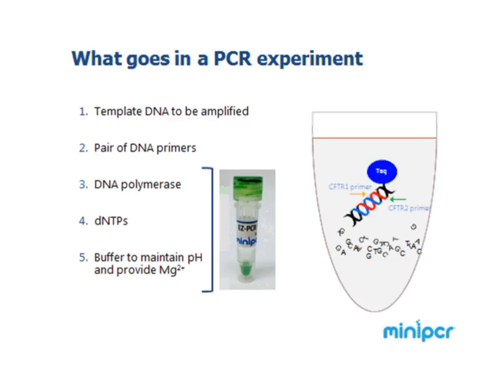So now that you are back, the template DNA that you're going to need to amplify, and amplify means to make many, many, many copies of it, is going to be suspect A, B, H, and D.